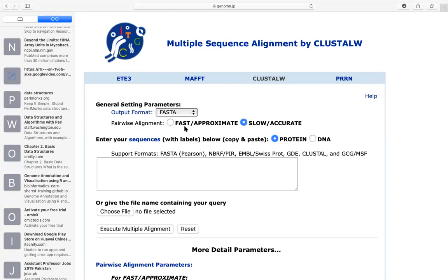You need to enter your input sequences here — copy and paste your sequences with labels below. You can use whatever you want: protein or DNA. In the last lecture, we aligned pairwise DNA sequences, so this time we will work on protein sequences.